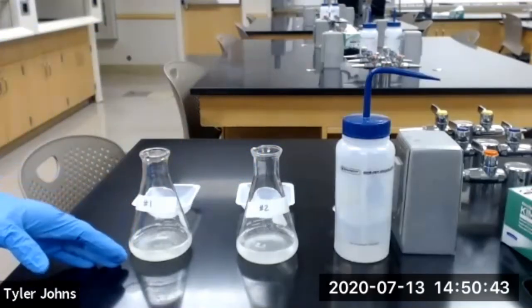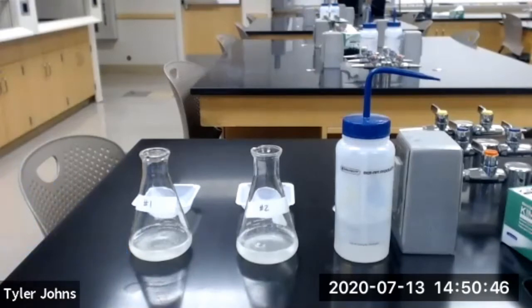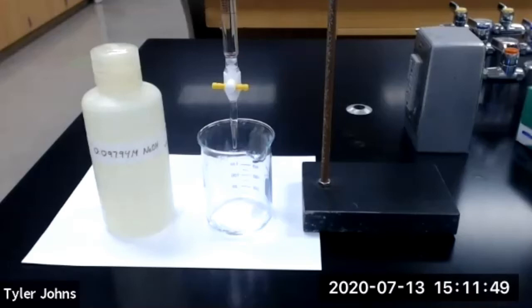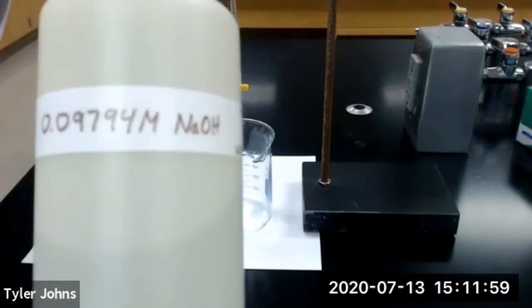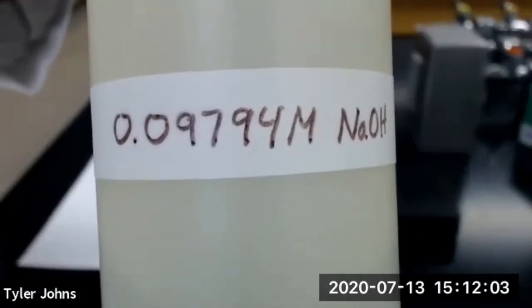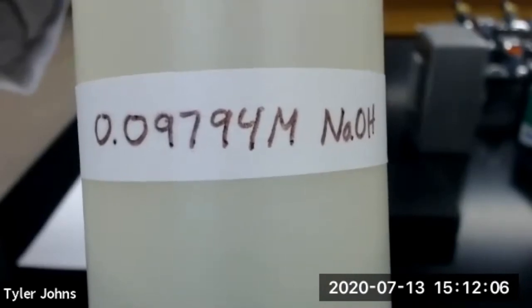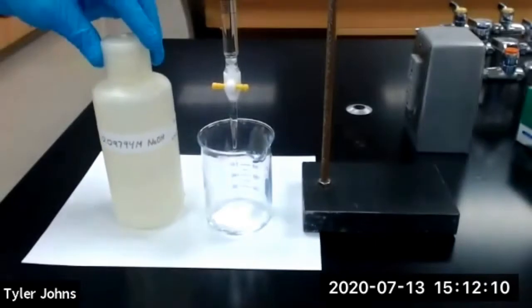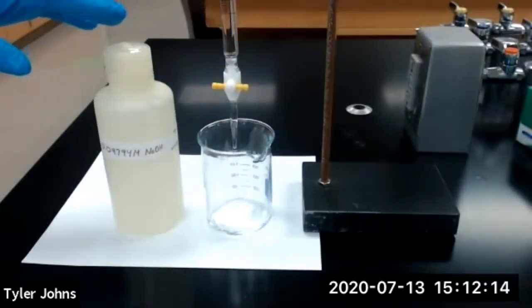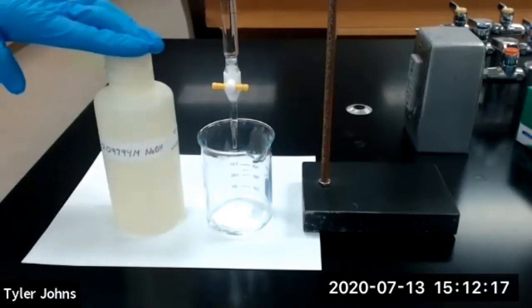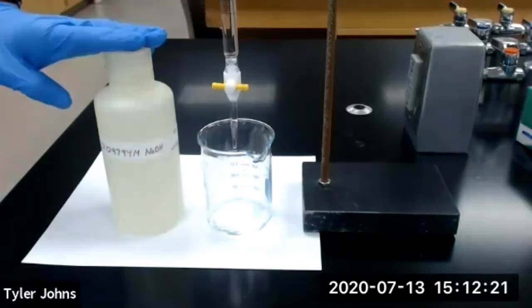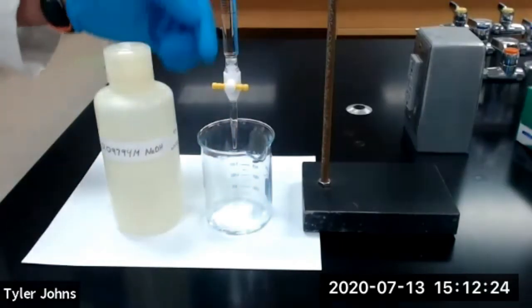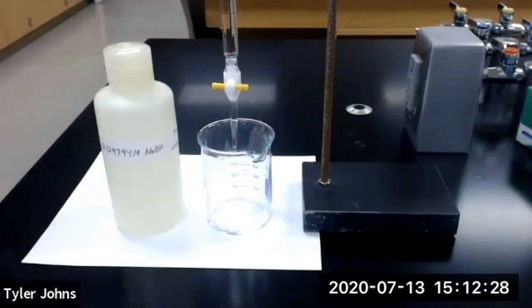While we allow the vitamin C to dissolve in the deionized water, we'll set our burette up for titration. I prepared our burette by washing it with deionized water and a small amount of soap, then rinsing it several times with deionized water. I then rinsed our burette with 5 milliliters of our previously standardized sodium hydroxide solution, which is 0.09794 molar sodium hydroxide. I dumped that wash into the waste beaker, filled our burette with the standardized sodium hydroxide solution, and opened the stopcock to allow some solution to flow through the tip to remove any bubbles. Our burette is now prepared for titration.